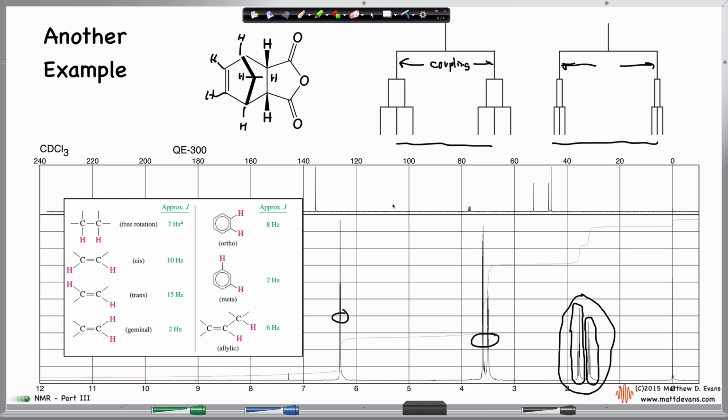Now, when we finally do the synthesis, we're not going to see much of anything. So if you're interested, you can dig up the spectrum from aldrich.com. It's there. I forgot how to name this, so I ended up drawing it in Aldrich. Aldrich is really nice. It allows you to draw the structure, and then it'll do a search on the structure. I drew it in, I found it, and there's an NMR spectrum for it.